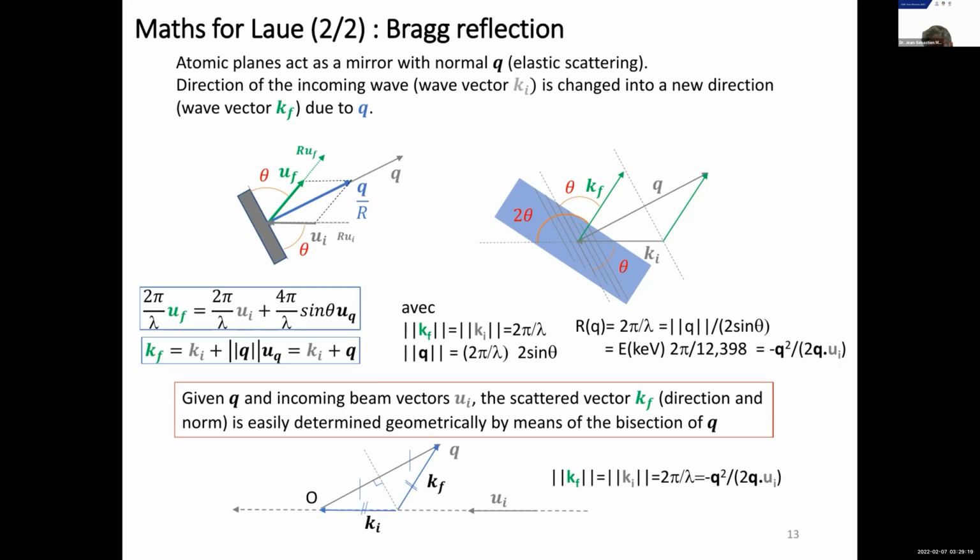So it's nice to understand that, just because it will help us to understand in a handy way what's going on in the material as soon as you stretch the material and you rotate the material. So it is a really simple and nice description of the mathematics and the geometry of the reflection.